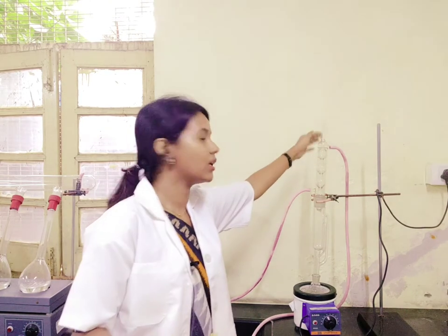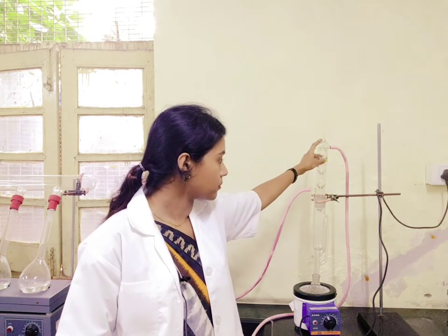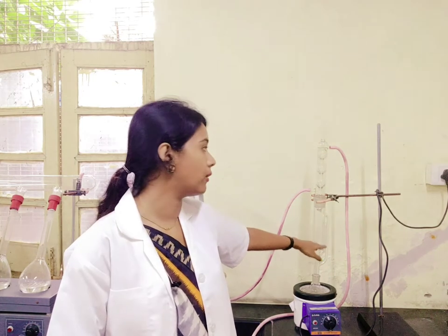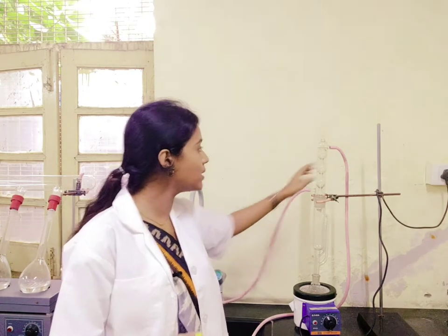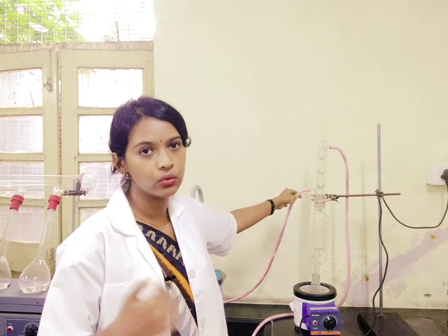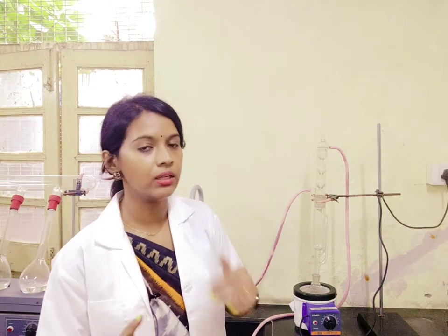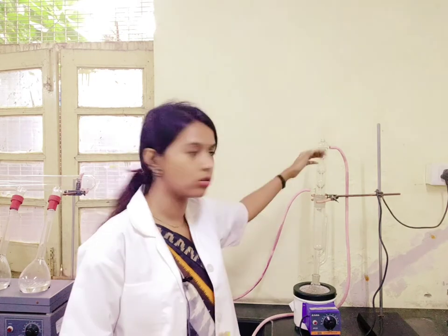On top of the Soxhlet chamber you can see this condenser tube. The main function of this condenser tube is to cool down the solvent vapour, so that it can trickle back down again. In this condenser tube you have two tubings attached — one is for inlet and the other one is for outlet. Since it has to always cool down, it must have a cool water supply, so it is connected to tap water so that cool water will continuously keep running through the instrument, keeping the top part always cool and condensing the solvent vapour that is rising up.